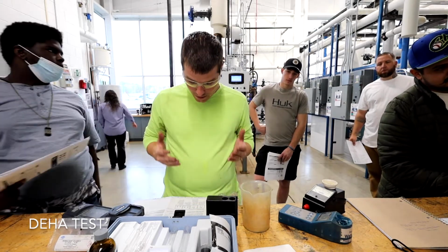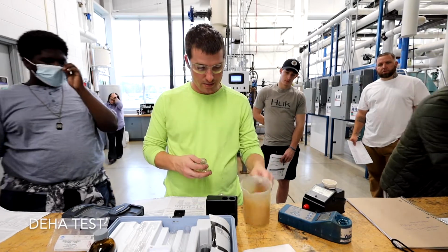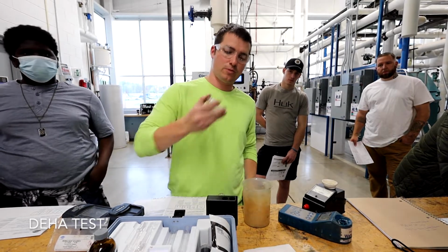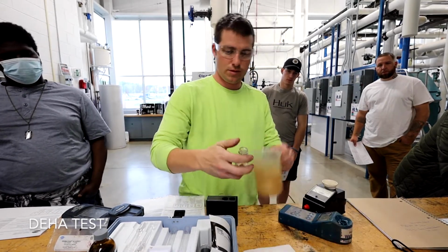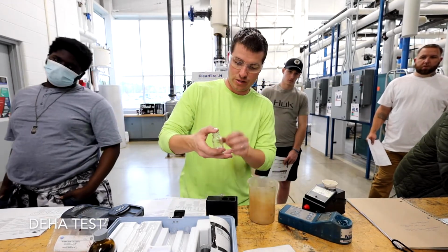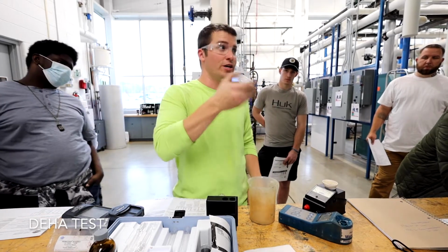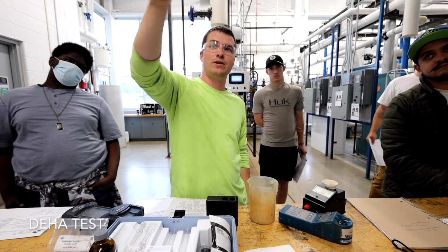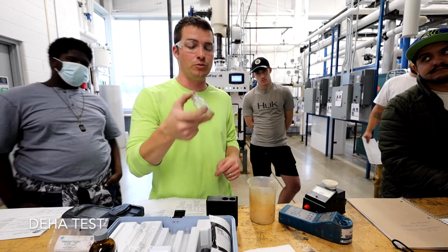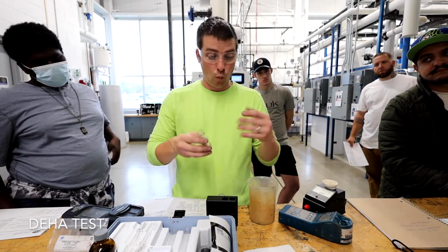All right, so thoroughly rinse one mixing bottle with sample and fill to the 25 milliliter mark, and write S on it. So this one's going to be our sample. We'll fill it up a little bit and rinse it. The last time this was run, and it's not any of you, this wasn't rinsed out right. You can see there's some dry stuff left over, and that could interfere. It's already turning slightly pink purple, which tells me again there's old stuff. So when you're done with your test tube, ideally you want to rinse it out and not let it air dry with what was in there.